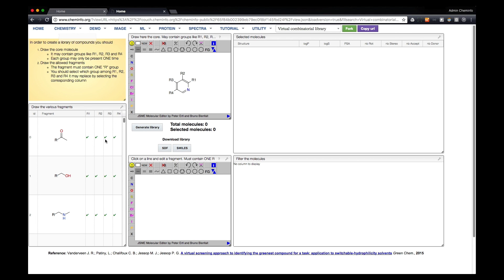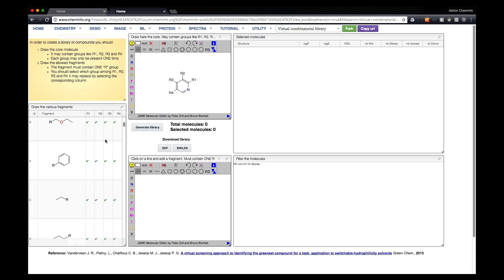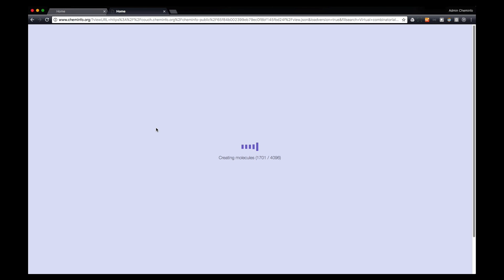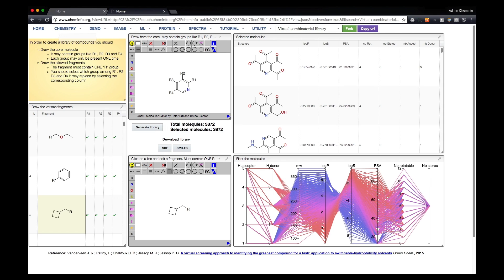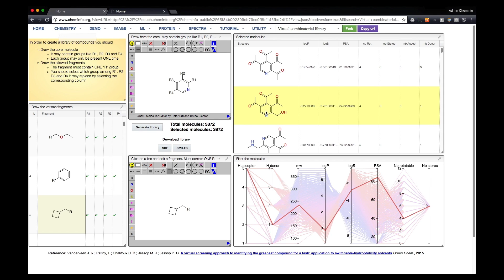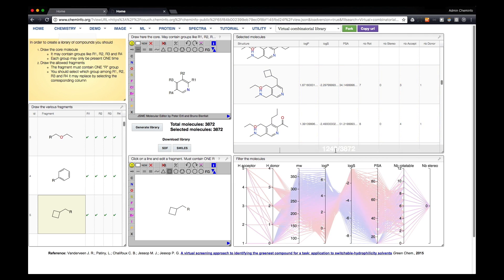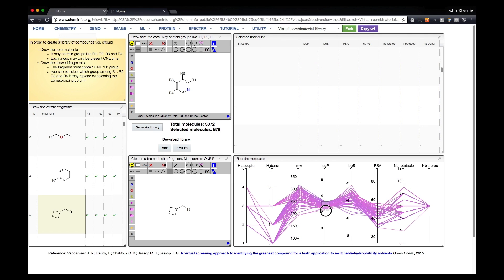One example is the virtual combinatorial library, where based on a template, you can draw some groups that you allow on the core molecule, generate all the molecules, and see the result directly in the browser. These are really some modules that interact between them, and this kind of application can be done in just a couple of days.